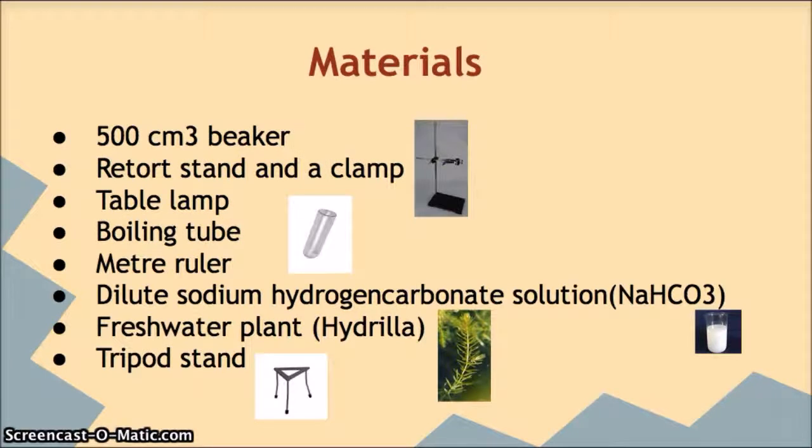The materials used for this experiment are a 500 cm³ beaker, a retort stand and a clamp, a boiling tube, a table lamp, a meter ruler, a dilute sodium hydrogen carbonate solution, a freshwater plant, in this case a hydrilla, and a tripod stand.